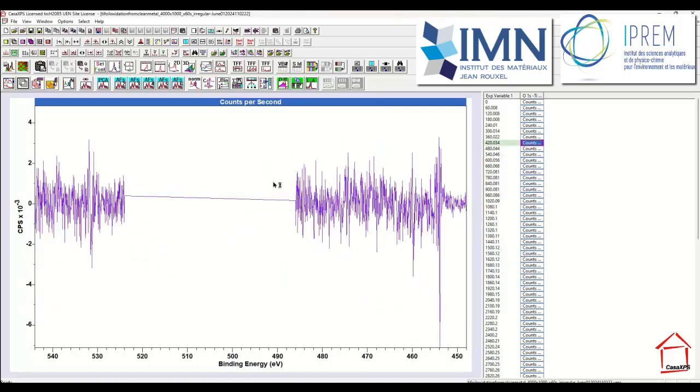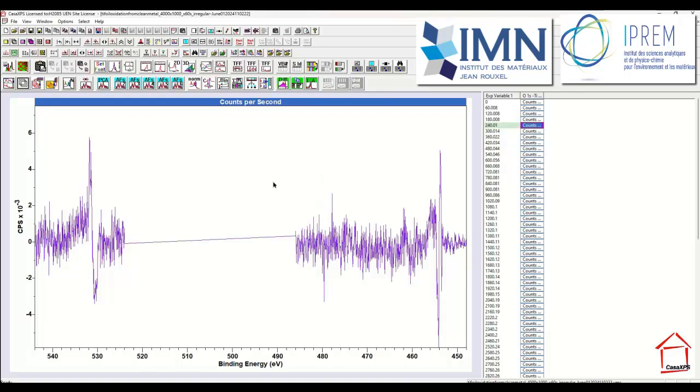And so if we only include in a least squares fit a set of abstract factors where we see something that might be important, then we will have better signal to noise, and the noise will be suppressed in the rest of the data set. So that's the basis of how you might use PCA and the reproduction of the data with PCA to improve the signal to noise in your data set as a whole.